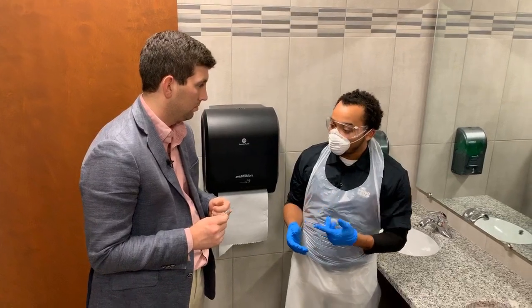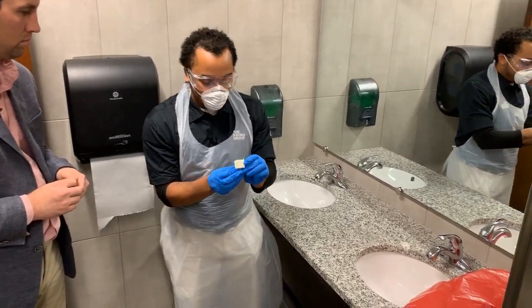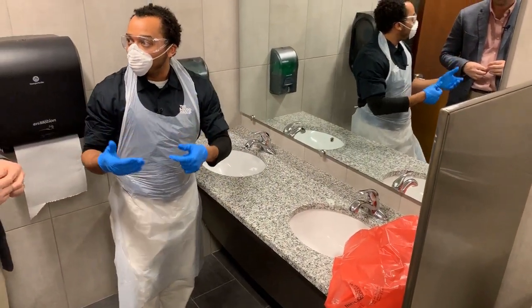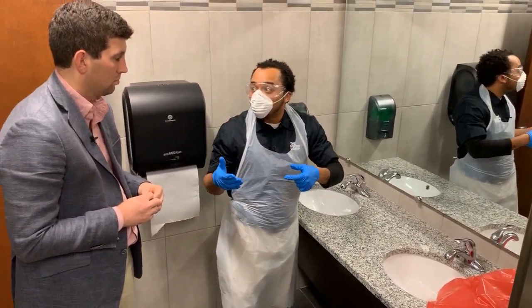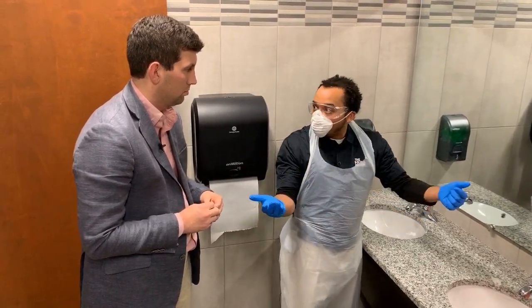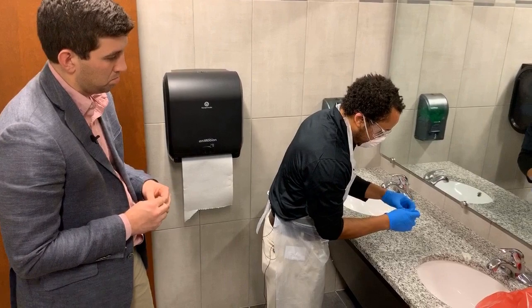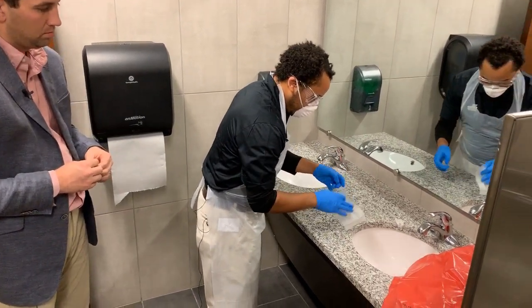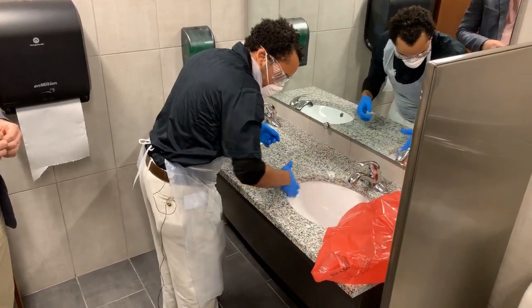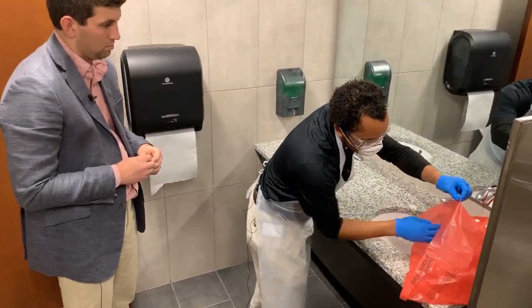Now what? Now you're going to hand me those moist towelettes right there, and I'm going to finish sanitizing the surface. Now, mind you, you always want to be thinking while you're doing this and be cautious. You can never be too cautious and move too slow. Because you see, I still have my arms exposed, and I can accidentally touch it, and I might have an abrasion or a cut on my arm. So now, I'm just going to wipe the surface as before. And we're going to place this content in the red biohazard bag as well.